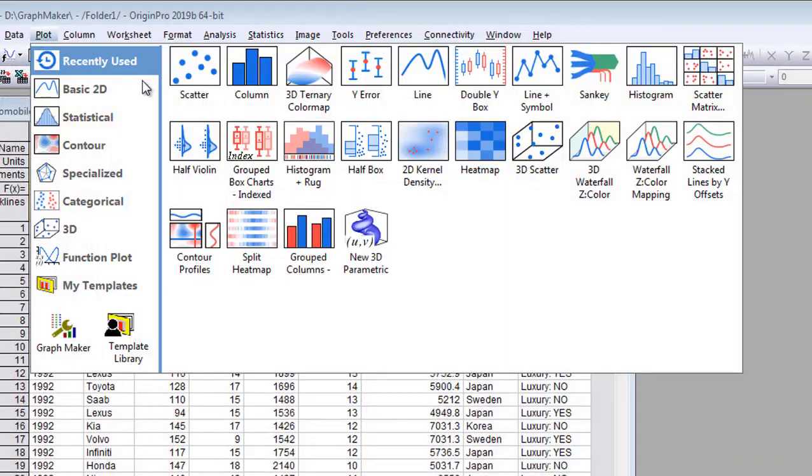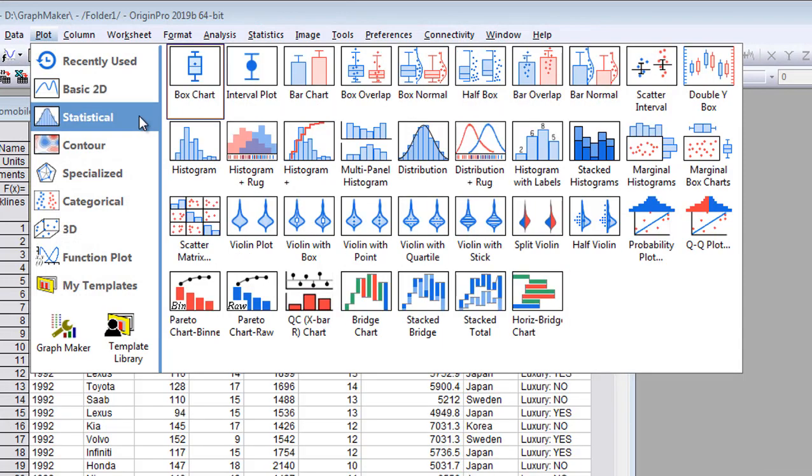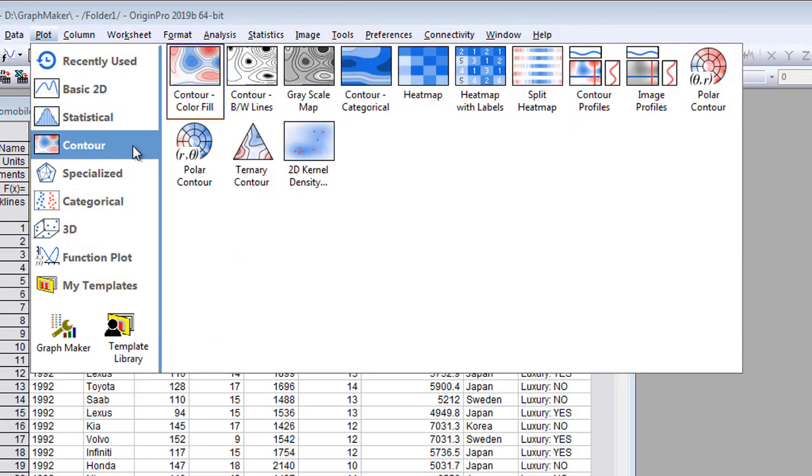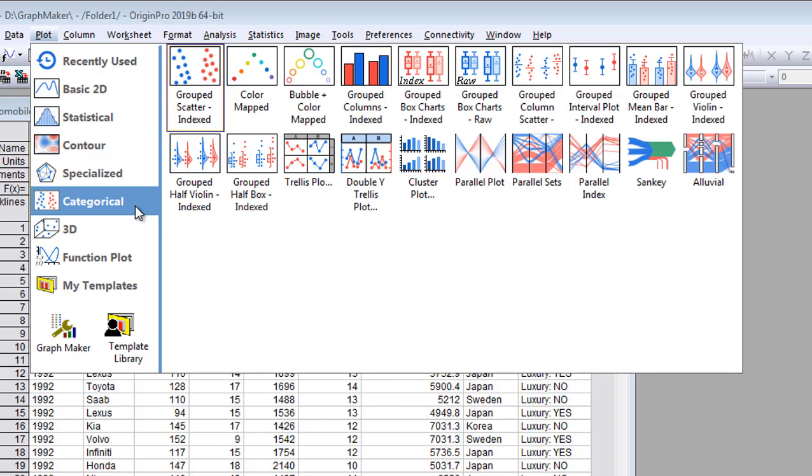Origin ships with over 150 graph templates for you to select from, arranged by category under the plot menu.